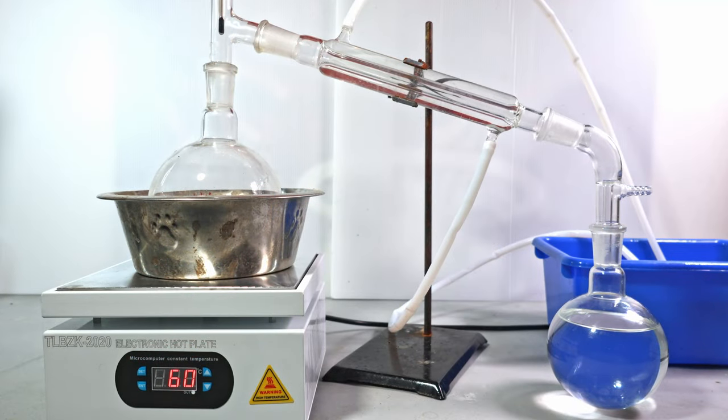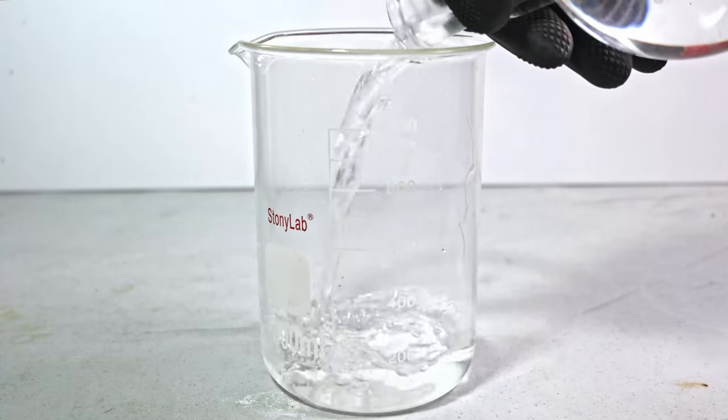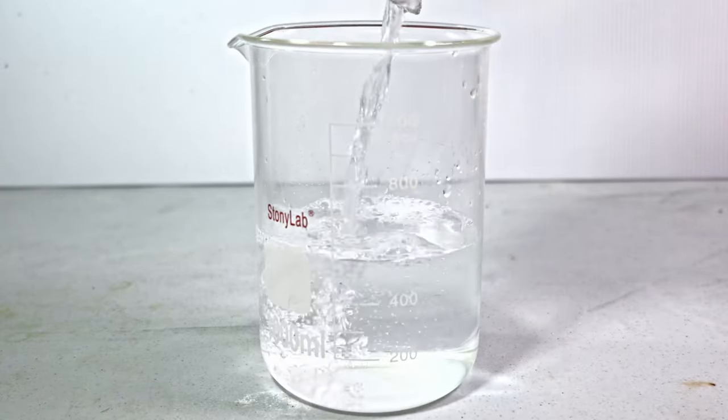Eventually, all the tert-butanol is distilled. My receiving flask is almost filled to the brim. In the boiling flask, a lot of my sieves are still caramel colored, which means they are full of water. In all, I got a little over 550 milliliters of tert-butanol.